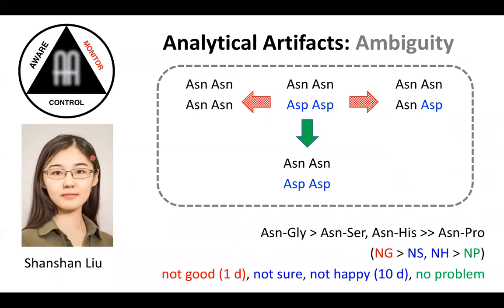So here is really the key issue. If we see a result of deamidated species mixed with asparagine, here I'm only showing the aspartic acid, there's potentially isoaspartic acid. This can mean three possible scenarios. The first one is if we see, say, 50% asparagine and 50% deamidated product, it could mean that the original sample has exactly the same amount of asparagine and aspartic acid or isoaspartic acid. So there's no analytical artifact. Again, the results truthfully reflect what's in the sample.